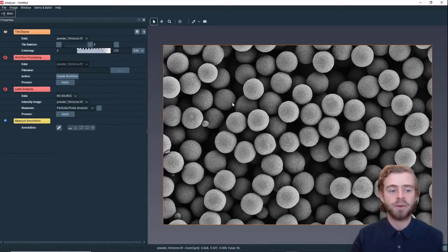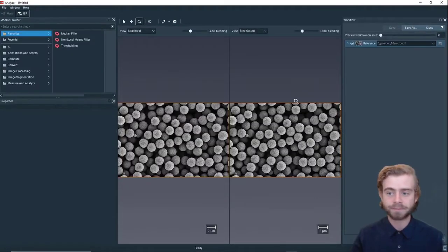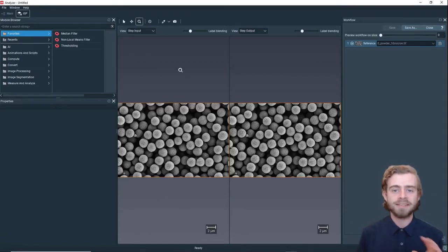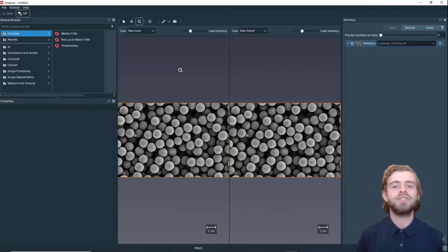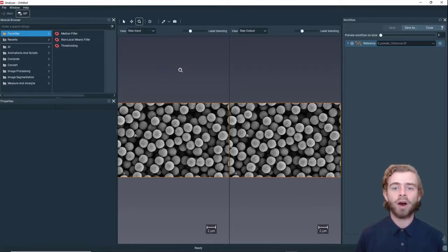Now that we've loaded the data in, we're going to create an image stack processing workflow. To do that we're going to click Create Workflow. The image stack processing workroom allows you to build workflows for processing your data. It is a flexible and dynamic environment that allows you to iterate quickly and easily, and it also provides continuous feedback on each step that you add.